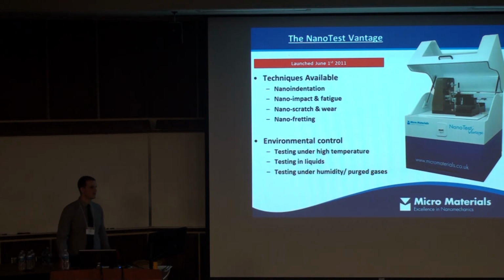Can they be quantified in terms of fracture toughness value? What's done in some cases is you get cracking from the points of the indenter, and then measure the length of the cracks and stuff like that. Obviously the results in these experiments relate directly to fracture toughness. Obviously, tougher materials will be more resistant to this kind of testing. So yeah, there is a good correlation between fracture toughness and impact resistance to this technique.